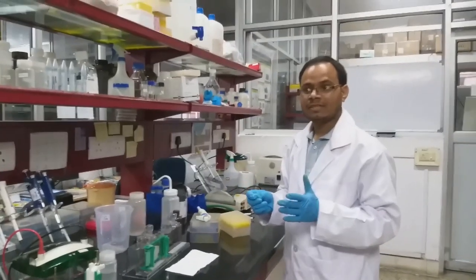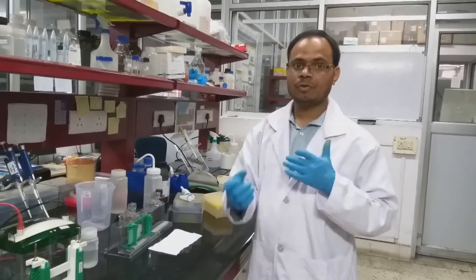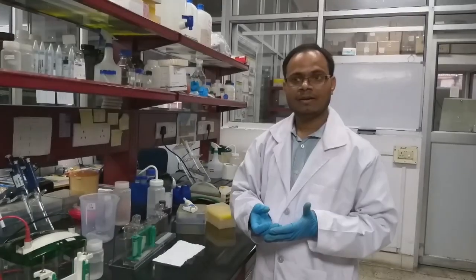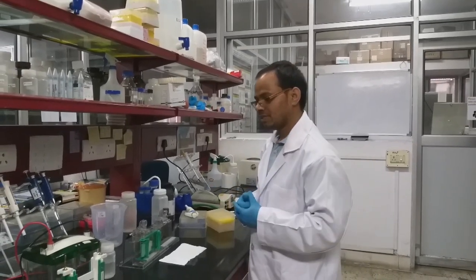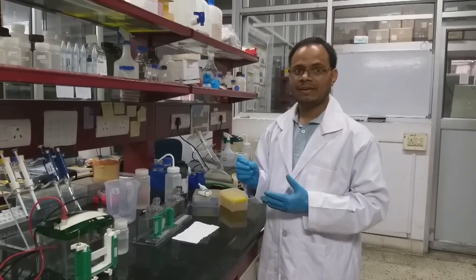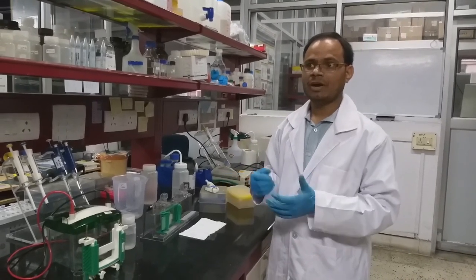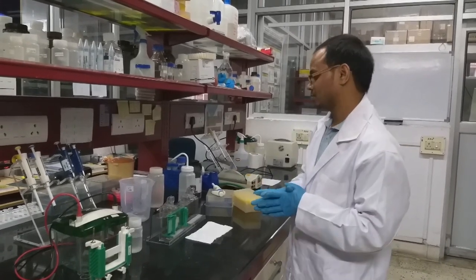So after this, we have to overlay the top layer with some solvent like 2-butanol or isopropanol or with water. So why are we doing this? Because if the gel is exposed to air, then the oxygen from the air will interfere in the polymerization of the gel. So we have to add either water or 2-butanol for this purpose.